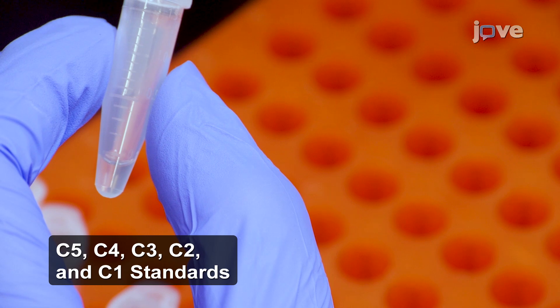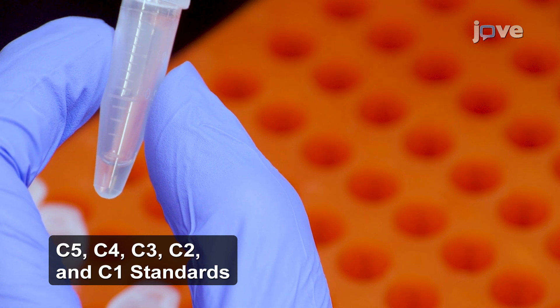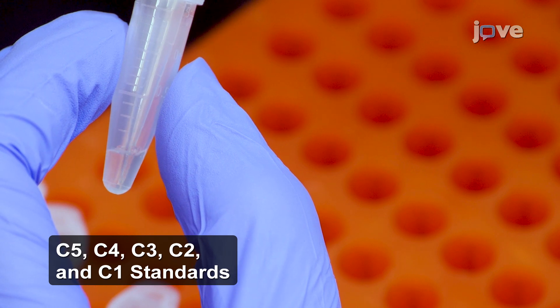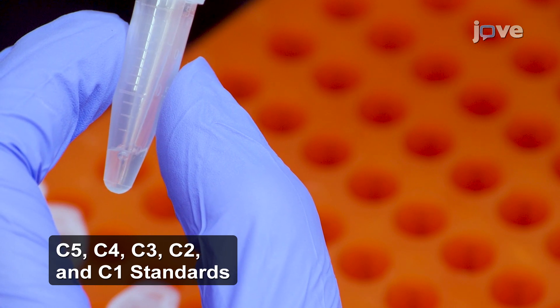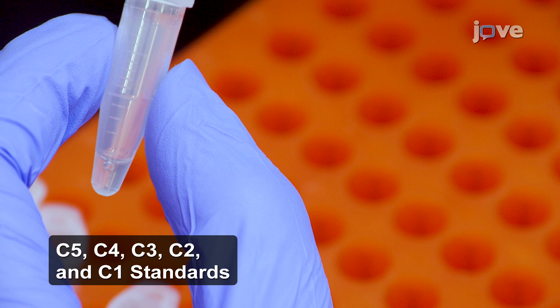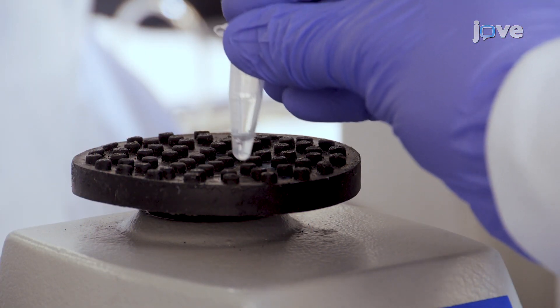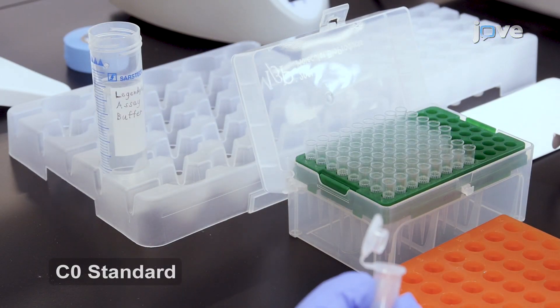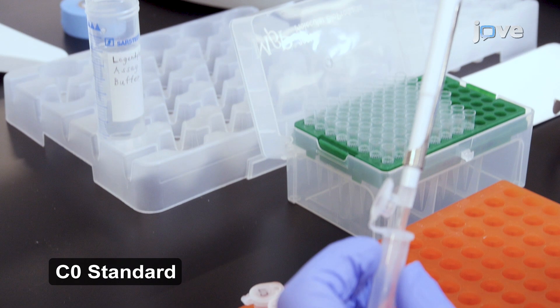Continue performing serial 1 to 4 dilutions by using a new pipette tip for each tube to add 25 microliters of the previous standard to the 75 microliters of assay buffer in the next lowest standard tube. Follow each addition by vortexing. Use assay buffer as the zero picograms per milliliter standard.